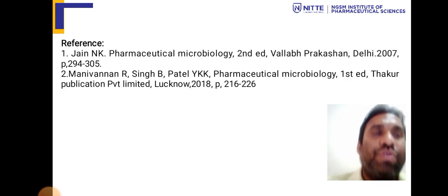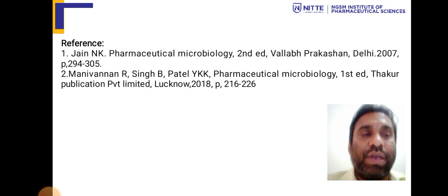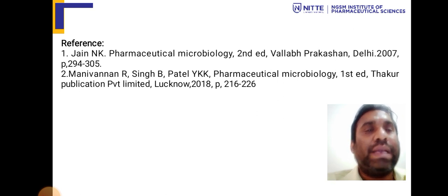So that's all for today. To summarize, we have learnt what exactly is the aseptic area, how to design an aseptic area, how to make a layout of the aseptic area, what are the services provided, and what are the precautions to be taken. So in detail we have studied what the aseptic area is.